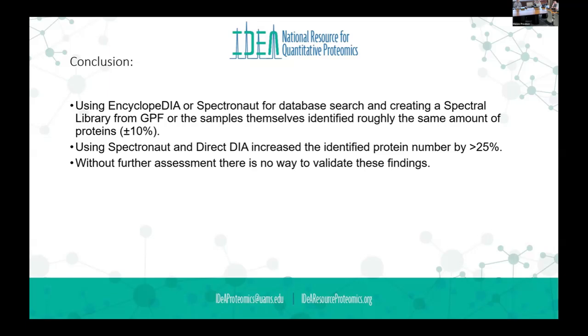I think maybe just one thing to mention too is that because machine learning is being used and these are models, if you run the same data set a second time, you don't get the exact same result.